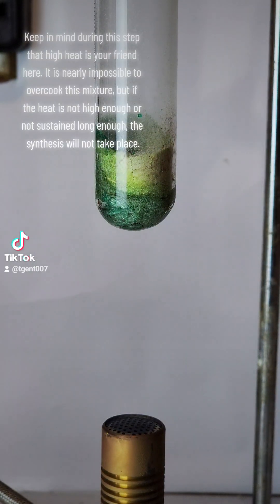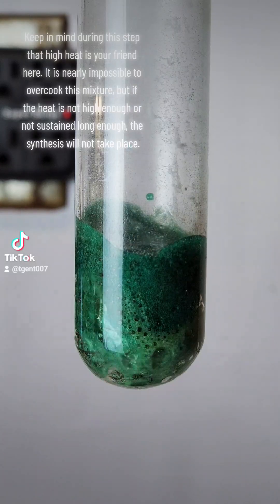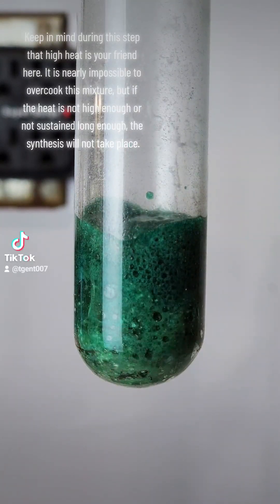Keep in mind during this step that high heat is your friend here. It is nearly impossible to overcook this mixture, but if the heat is not high enough or not sustained long enough, the synthesis will not take place.